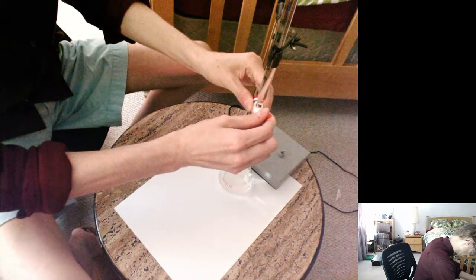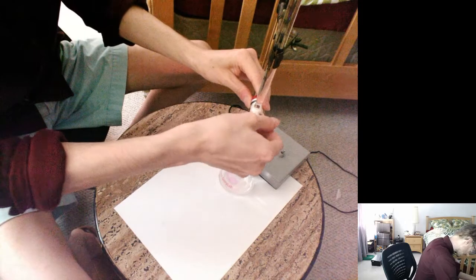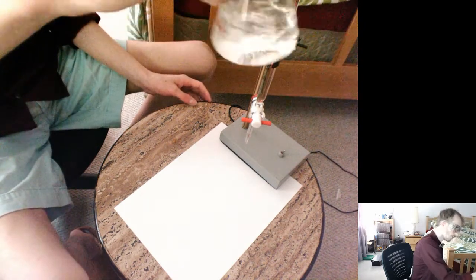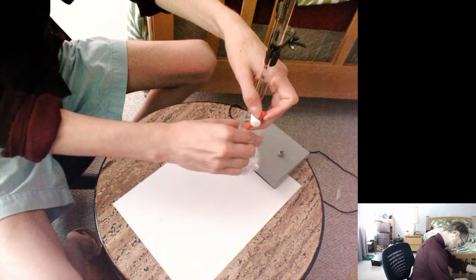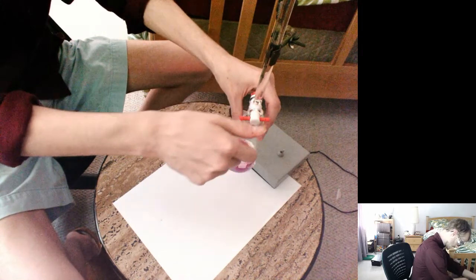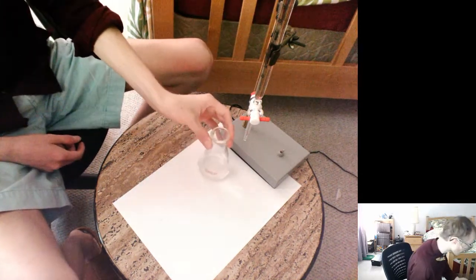base. So I'm going to drop the base, bam, like dubstep, but very slowly here. And so now it's just coming a drop at a time. And you can see even those little drops start to turn it a little bit pink, but then as I stir it up, it goes away. So we're getting very close to what we would call the equivalence point. So I'm going to drop it even slower. Now you can see that it's turning flashes of pink with every drop. Every drop is causing it to turn pink for a few seconds. But then if I stop it, which I just did, it's pink right now. But then if I stir it up, it still goes clear. So now we're getting really close.